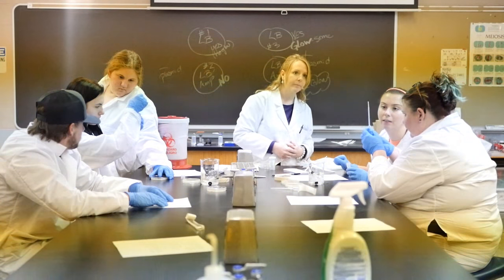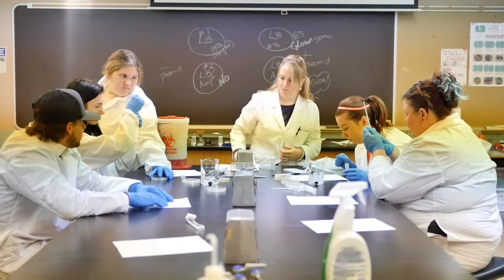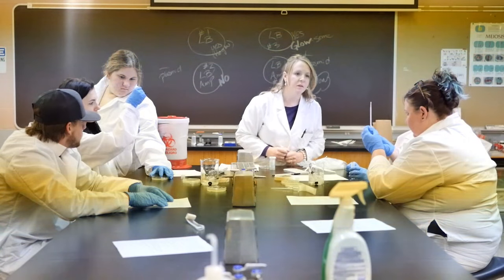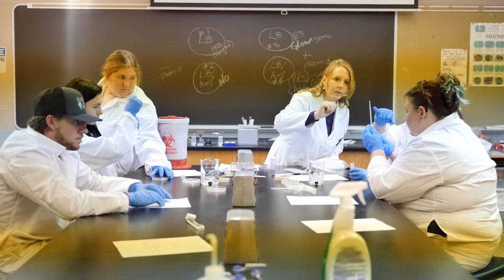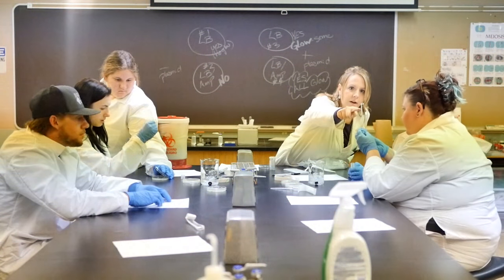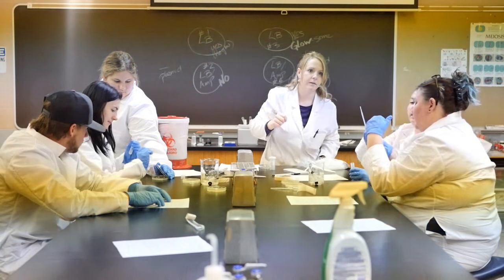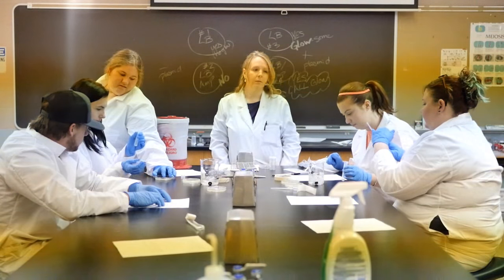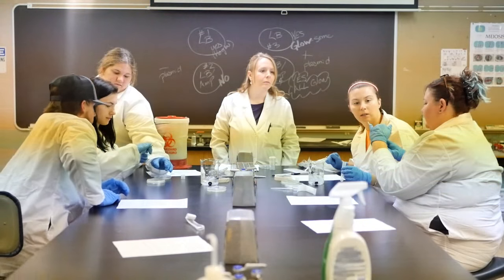Am I actually looking for 100, or am I just guesstimating it below that line? It doesn't have it marked. I don't see it. It's the lowest mark before it goes through. Below that is 250. Okay, that's 100, that right there. The one below it is 250. That's where we need to be.